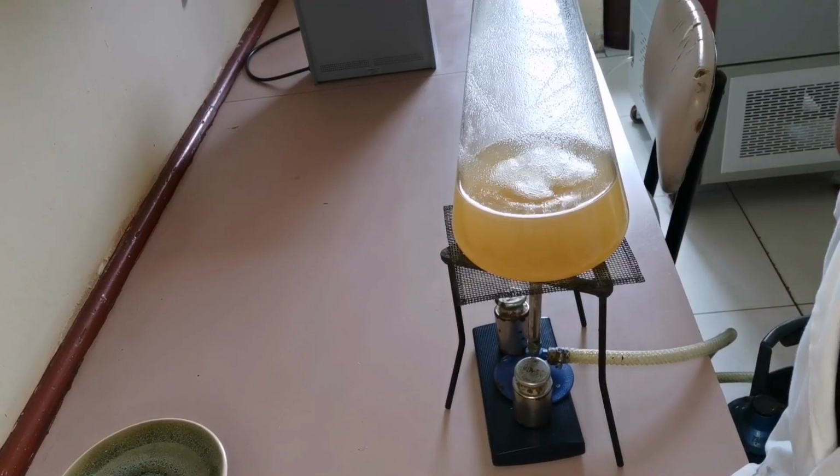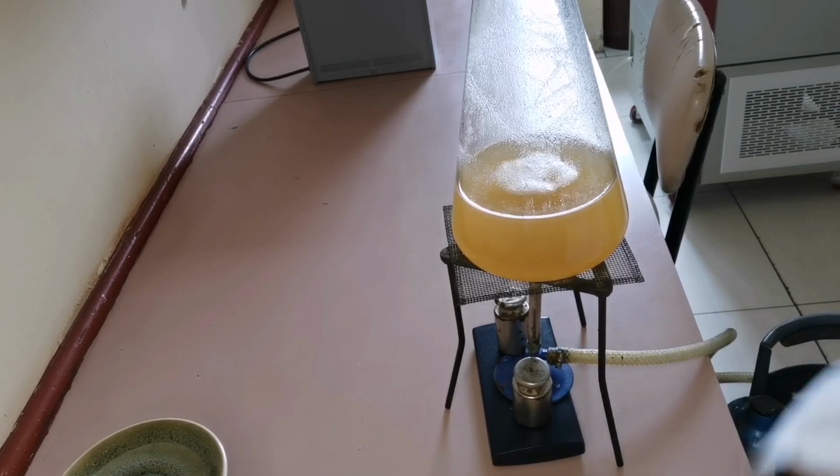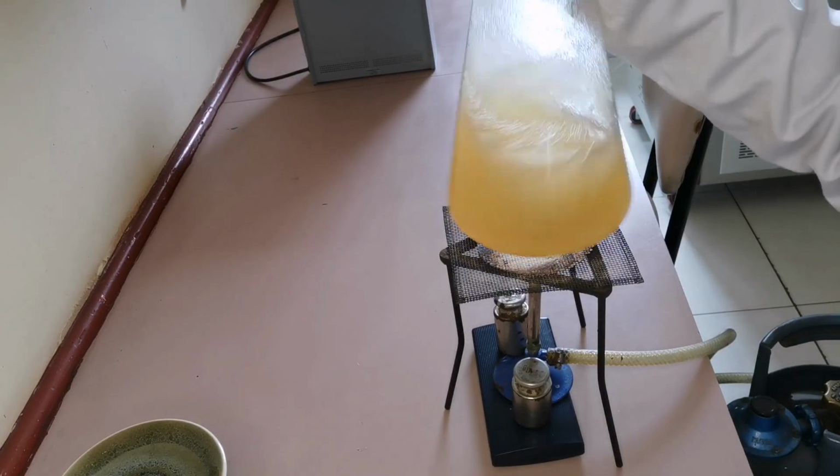While the PCA agar is boiling, you have to stir it so that it doesn't burn. Okay, like so.